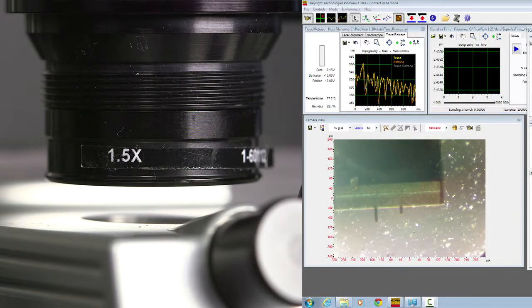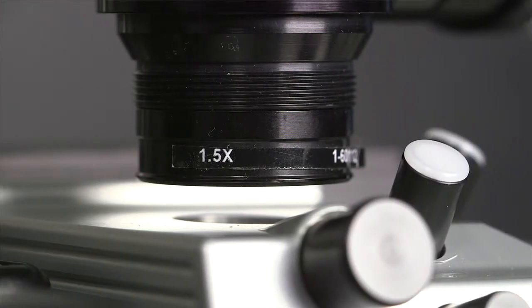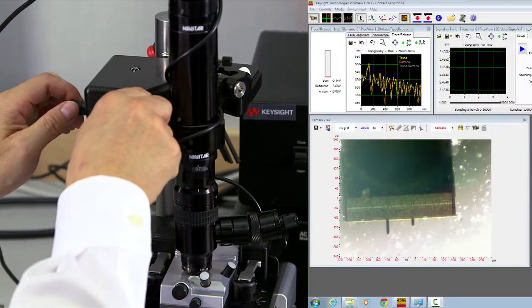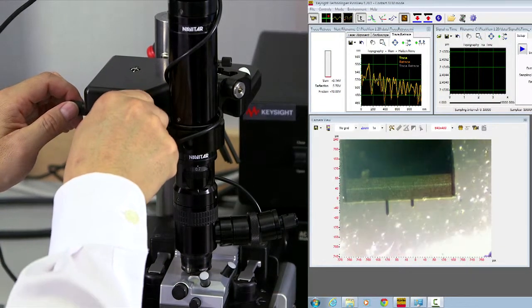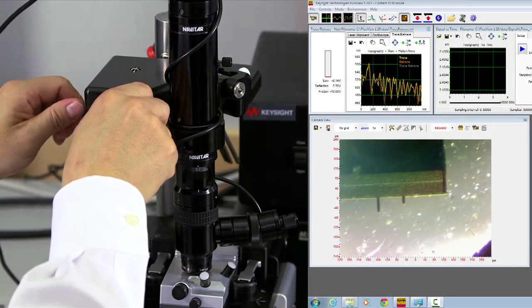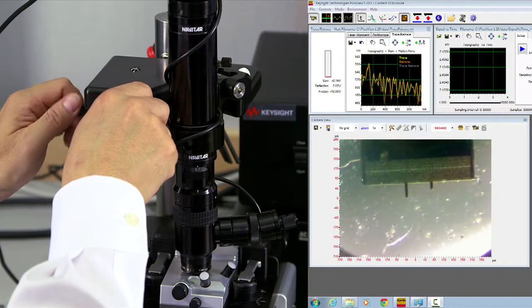Now you can see that the cantilever tip is coming to focus and notice the distance between the optical microscope objective and AFM scanner is very close. It's about 5 mm in distance. Here, translation again. And move the cantilever tip into the center of the view.